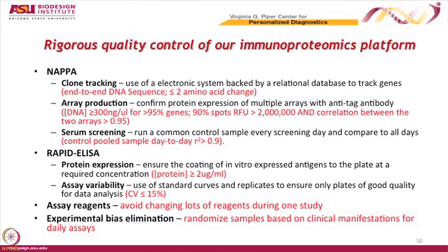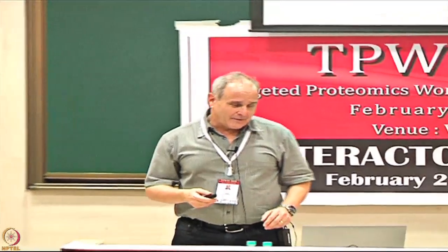So don't miss that. I had a postdoc who chased his tail for 4 months, thinking that he had found something really cool. And when we got down to it, it was because he ran the case plate first and then he ran the control plate second. And the control plate sat for 10 minutes while the case plate was getting read. And that was the difference. So you can't do that.